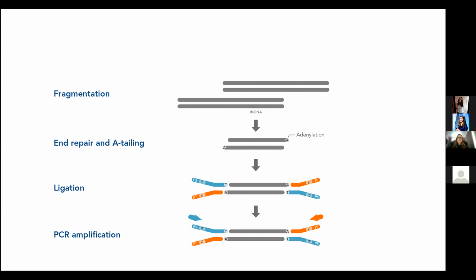After sequencing, we will gain only sequences. We will need to know which sequence belongs to which sample. So the adapter sequence also contains a very short index or barcode that will serve as an ID for each sample. And the next step is the amplification step.